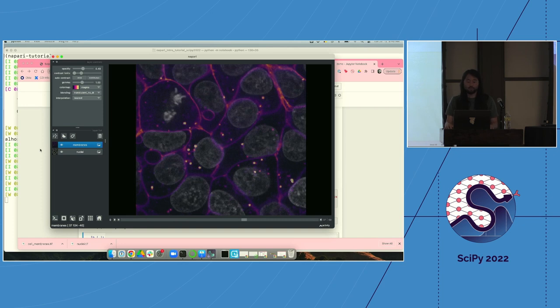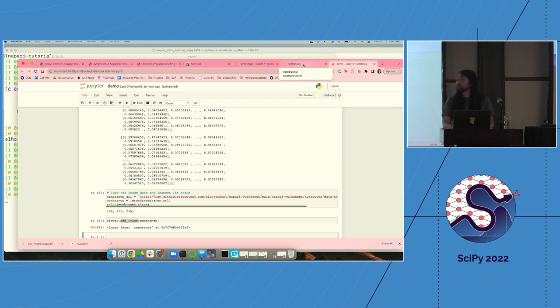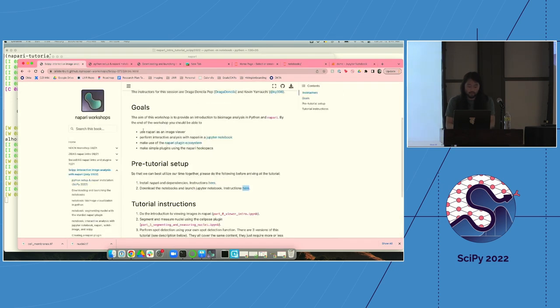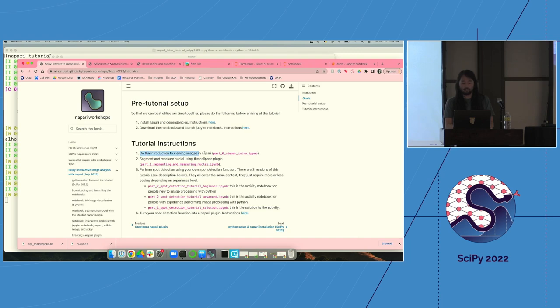That was a quick overview of some concepts in the viewer. In this first tutorial — Part 0 — you're going to do a lot of these things yourself. Fire up your terminal and launch your notebook. Did anybody have trouble installing? Great, we'll come to you. The first tutorial is the viewer introduction, which will rehash a lot of the concepts we just went over — explore and play, there's plenty of time, don't feel rushed.